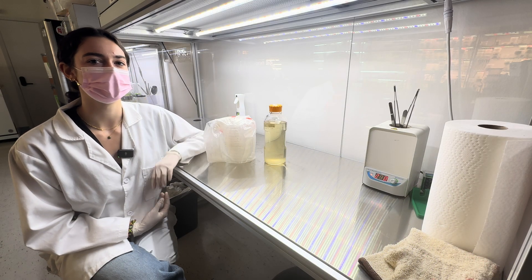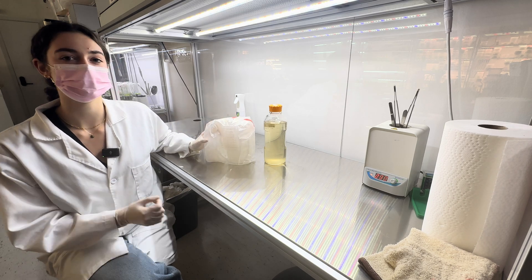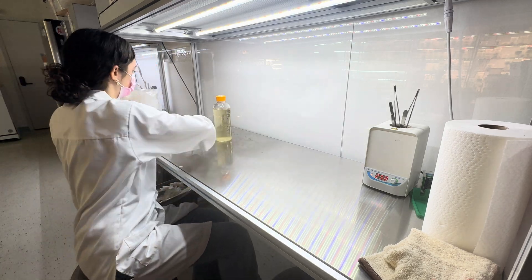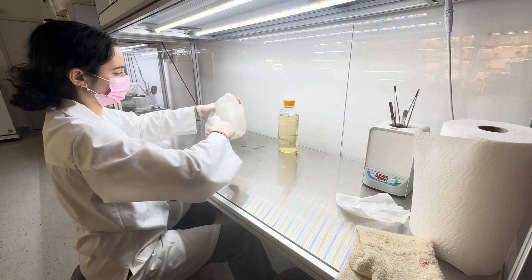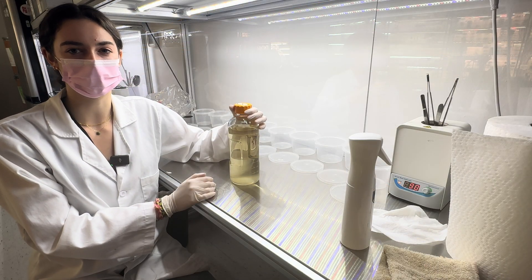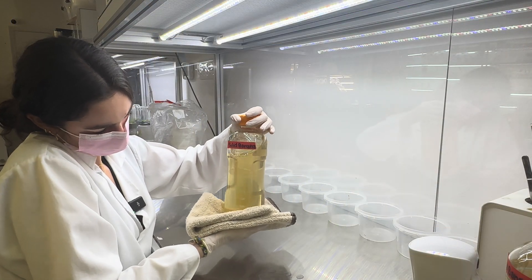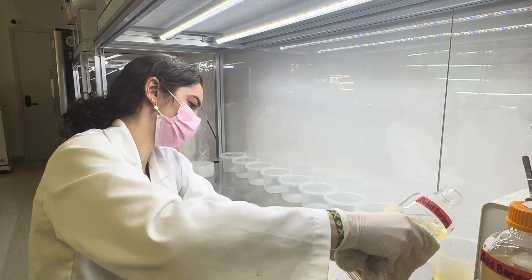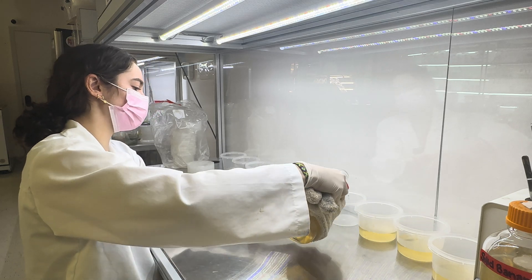Now it is time to pour your media. I have previously sterilized my containers using an autoclave bag, and make sure to spray down all surfaces before you begin pouring. Before you pour your media, make sure to shake your bottle to ensure that everything is properly mixed. If your media has charcoal, make sure you shake it between each pour.